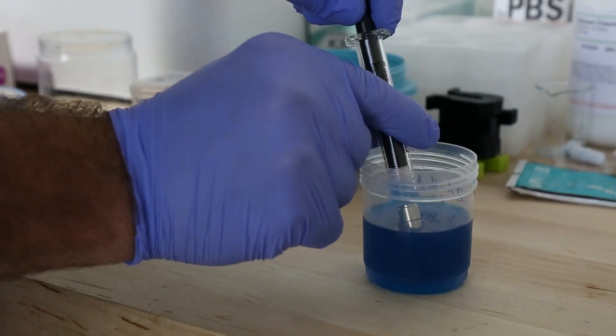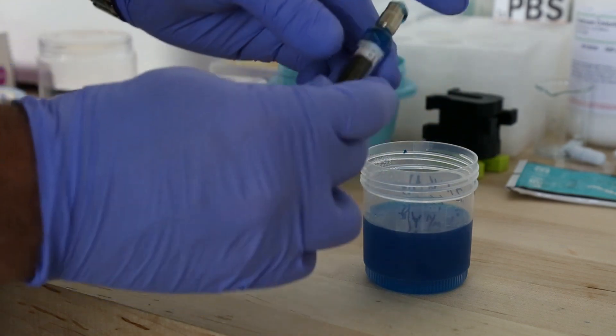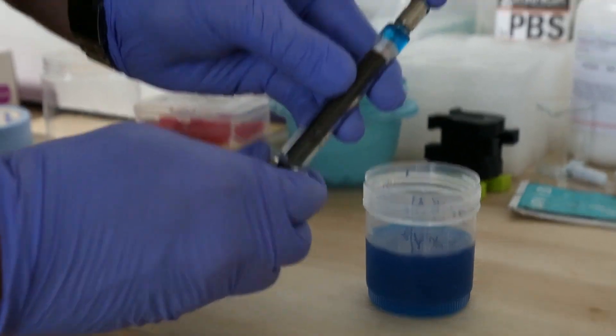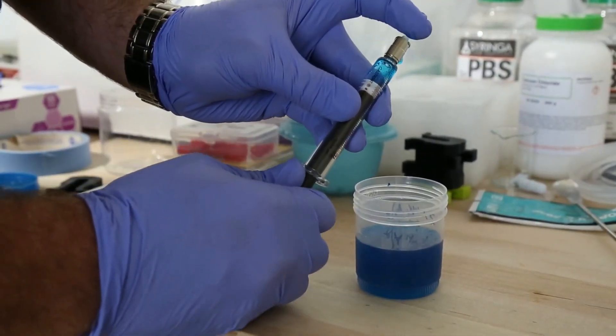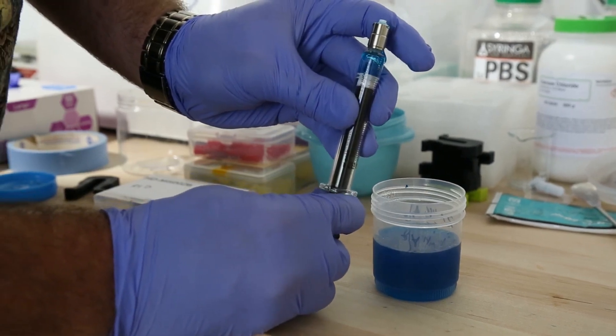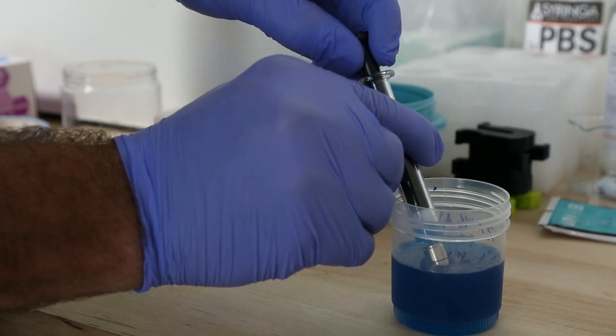So now we're gonna load our 5 milliliter gas-tight syringe. We've got a big air bubble on the top, so I'm gonna stop, flip it upside down, put my finger over the top, pull vacuum, and release. And now I should be able to push the air bubble out the top and then continue filling it.